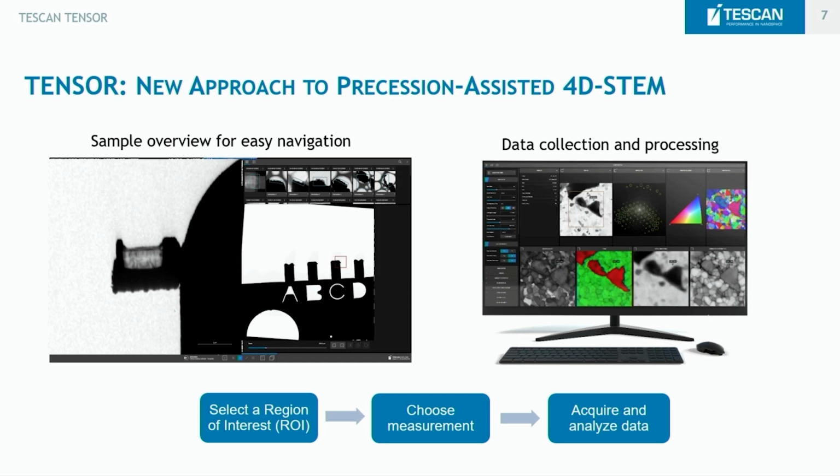So at the simplest level, you can go directly to an analysis and start acquisition and have usable data. If you want to go in and do things at a lens control level or at something very specific, that's all available too. Show you here, I can work this thing.